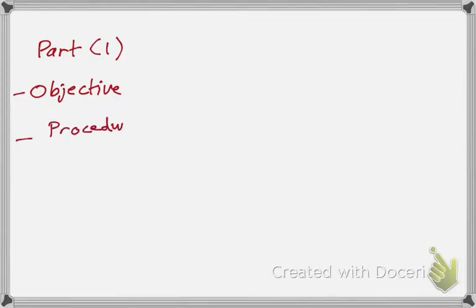What did I need to do and how I did it to get this part done, and this is what you will see in that video in your module for part 1. Then we don't have data and math to process in this part, so you will end up having a conclusion, and in our conclusion is the 2 wavelengths that we ended up choosing and why we chose them.